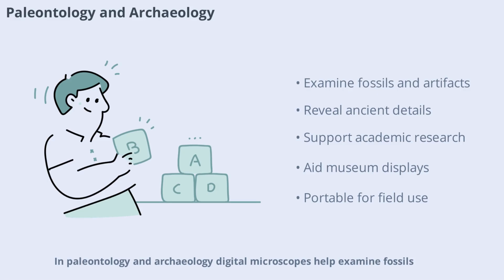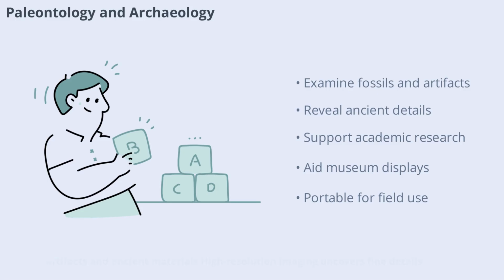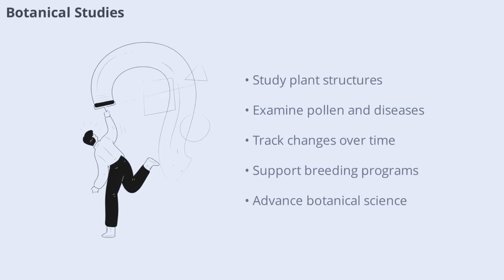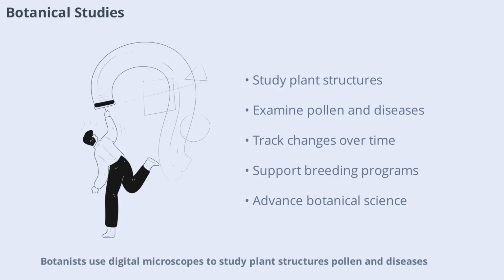In paleontology and archaeology, digital microscopes help examine fossils, artifacts, and ancient materials. High-resolution imaging uncovers fine details that inform research and preservation. Documenting findings supports academic studies and museum displays. The portability of digital microscopes allows for use in the field as well as the lab, broadening their impact on historical research.